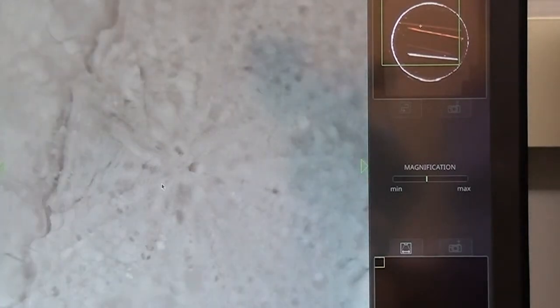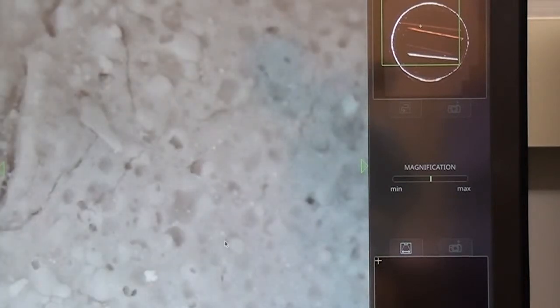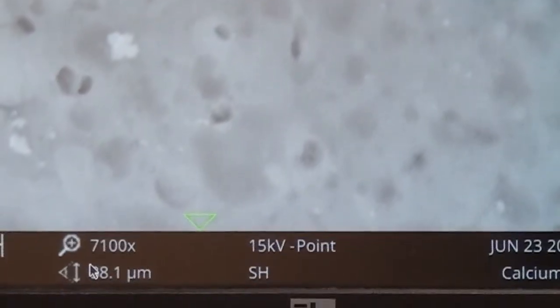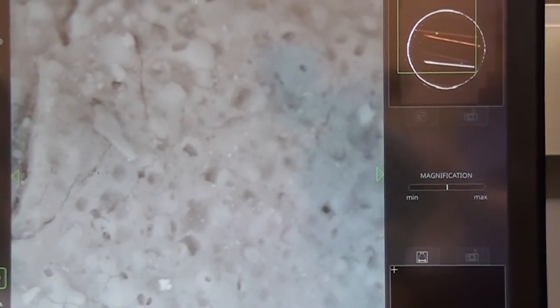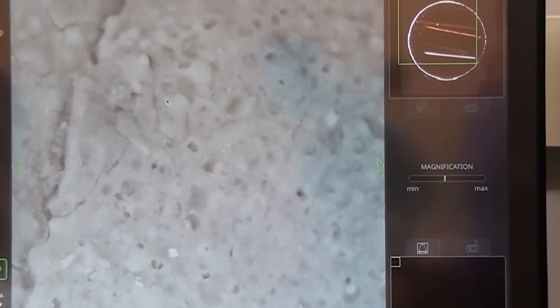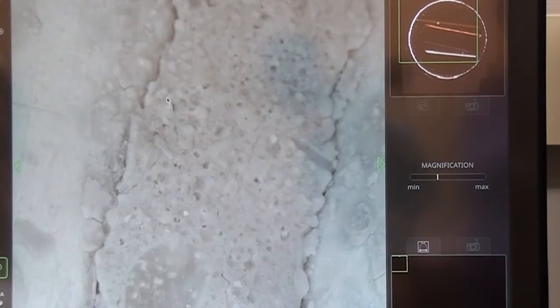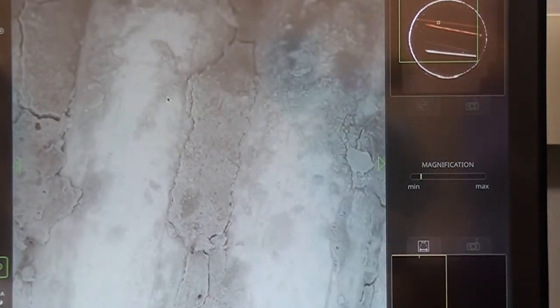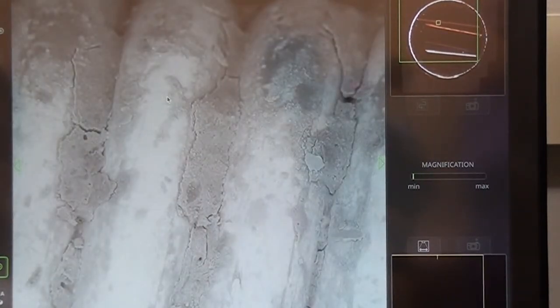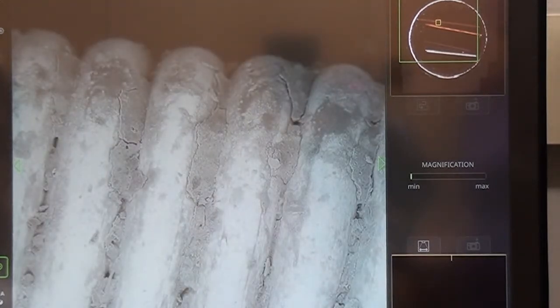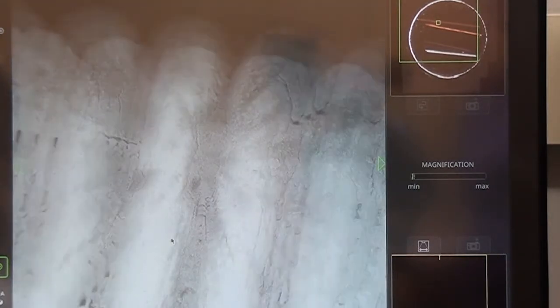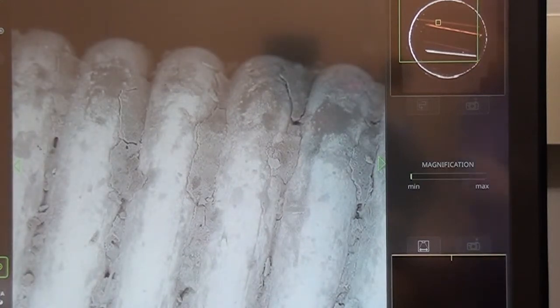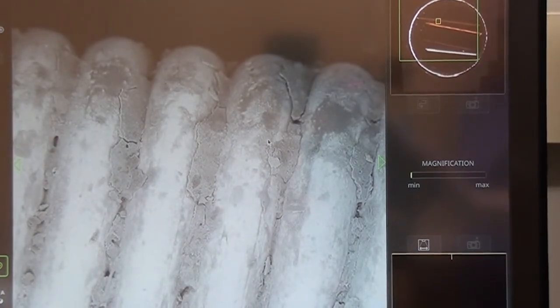Look at the structure here. It's almost at the magnification of 7,100 times. And we can see this little porous, powdery kind of flaky kind of structure over here. And now let's look at it under EDS.